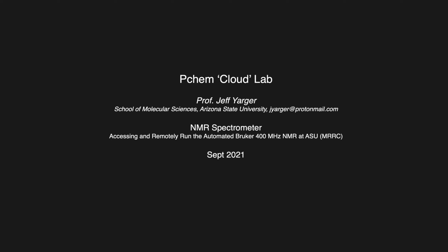In this video, I'm going to go over accessing an NMR spectrometer remotely for Pchem Cloud Lab. So we're going to jump right in to using AnyDesk, which is a virtual network connection, which is one of the primary ways we access remote instrumentation. And this has been covered in prior videos. So this is assuming you're already familiar with accessing using virtual network connections.